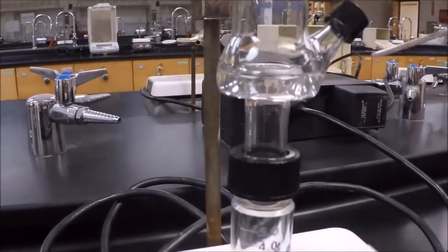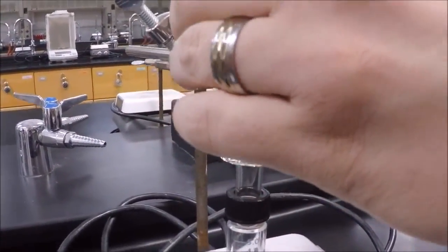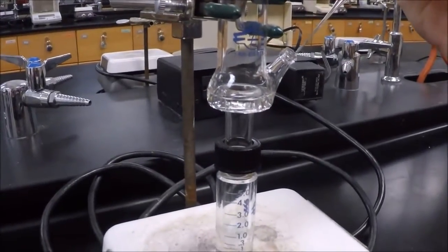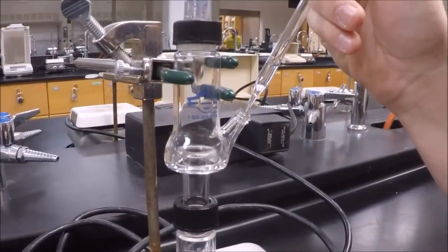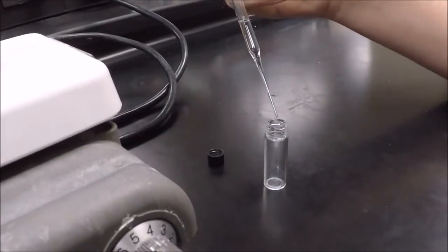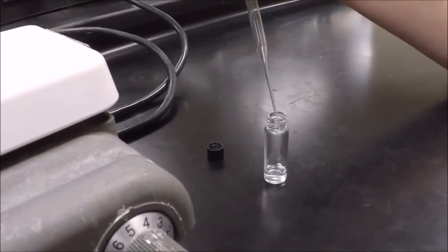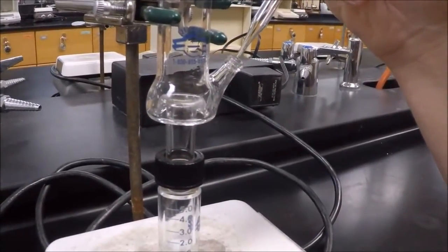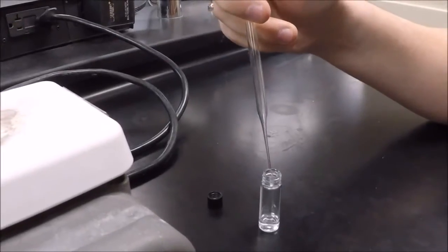Now we've had some of our solution collect here in the Hickman still. To get it out, you're going to unscrew the side cap, exposing the opening. This is hexane that's collected because it has a lower boiling point than toluene. Collect it almost as soon as it starts to show up, because the longer it sits, the less likely it will be pure hexane — toluene will start to evaporate and condense on the sides. Once you collect it in your pasture pipette, put it into the vial. Get as much as you can, because this is what we'll put into the IR later.